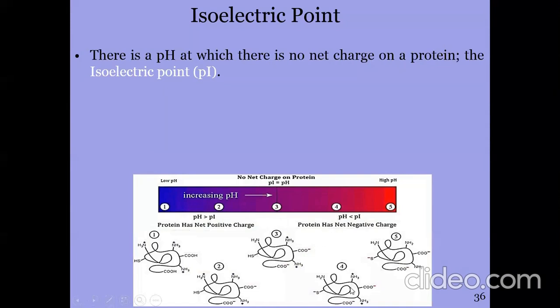After that, at this stage, this species will have more negative charge than positive charge. So negative charges are more here now. And after that, at this point, there is the maximum of the negative charges. So this is how it looks in this gradient. So this is actually the pH gradient.